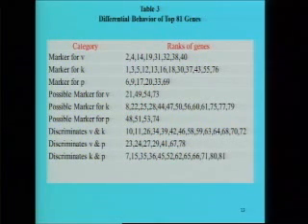Similarly, on the basis of strip charts and the p-values, we can identify the possible markers for these three prakrutis, or the genes which discriminate the prakrutis. So this is the behavior of the top 81 genes, and we are able to identify this using a variety of inference test procedures, which can also be validated by multivariate analysis tools and cluster analysis.